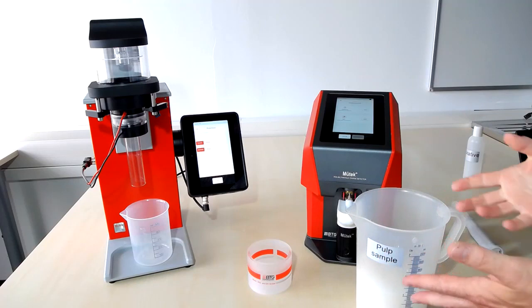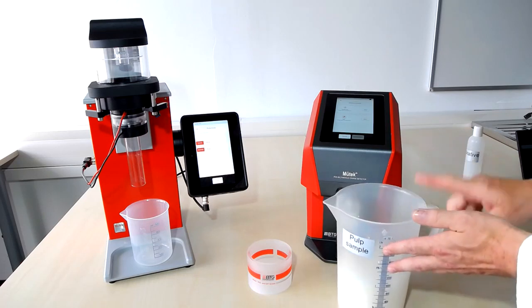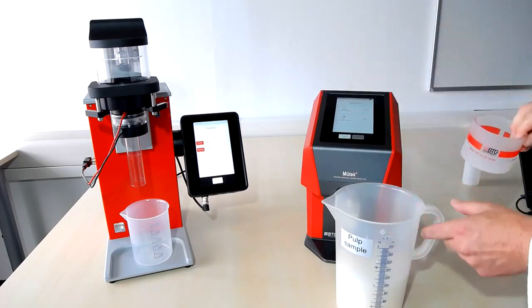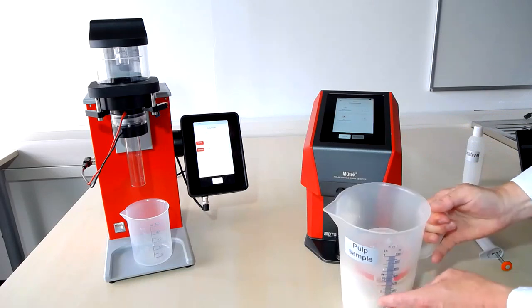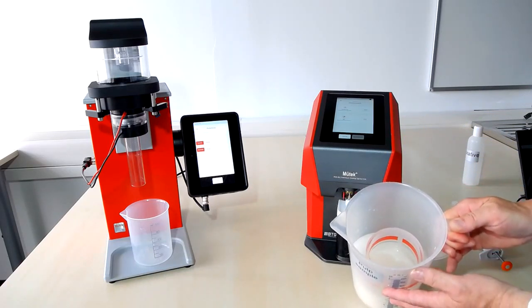For the PCD, this is measuring the dissolved charge, and dissolved charge happens in the filtrate. So we must extract a filtrate out of this pulp sample. And a very common way of doing this is using this screen beaker. Here we go. Screen beaker. Push it into the suspension and let it get some filtrate into the beaker.